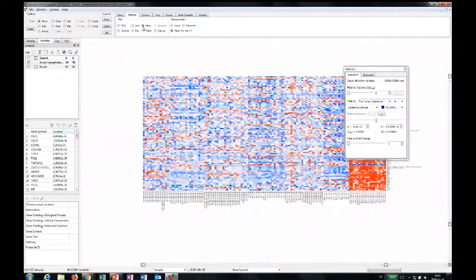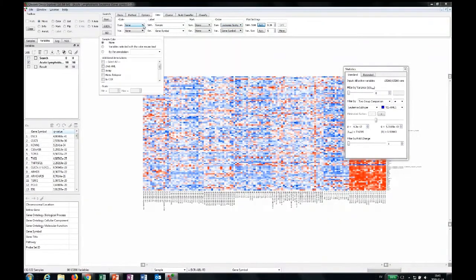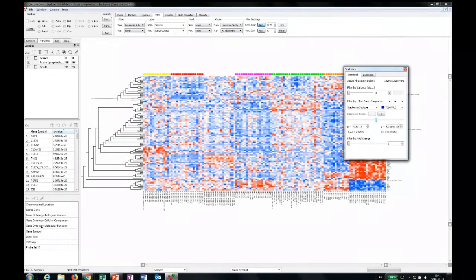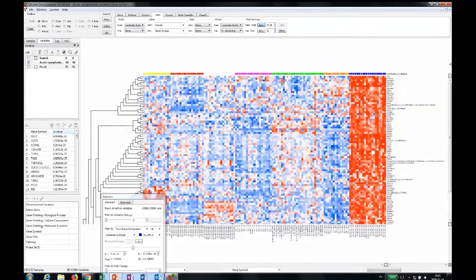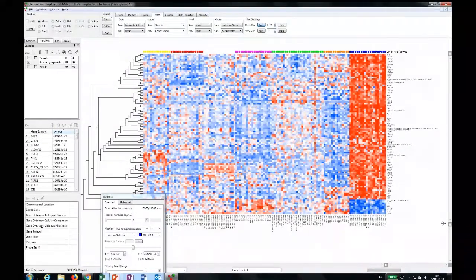We can then visualize it. We can use a heat map, and let's order that, for instance, according to our leukemia subtype we would like to see. So we have the colors here, and maybe we would like to do hierarchical clustering on the genes here. Then we can go up in size here, so you can see better. Almost one step too much.